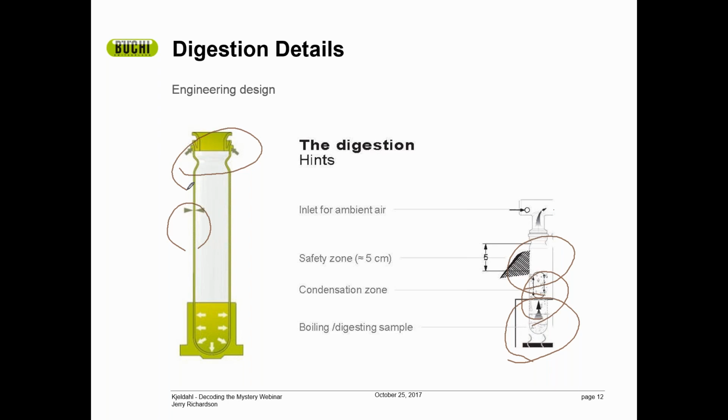And then the taper itself helps to also set up that zone, so that way we don't have issues along that line. And then it also helps to develop that seal. Based on that seal, the one thing we want to do is make sure that we have a good snug fit, so any fumes are being swept away rather than being released to the atmosphere.